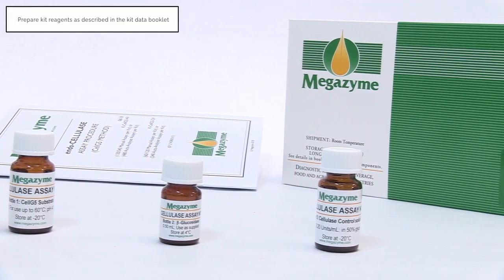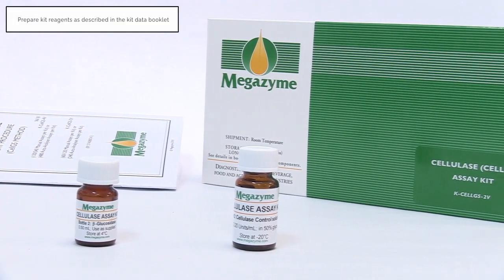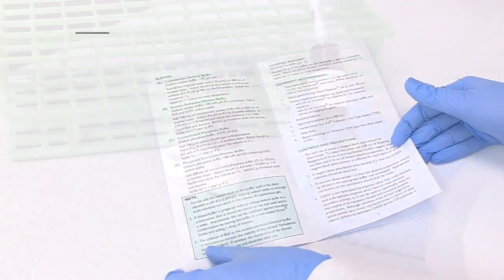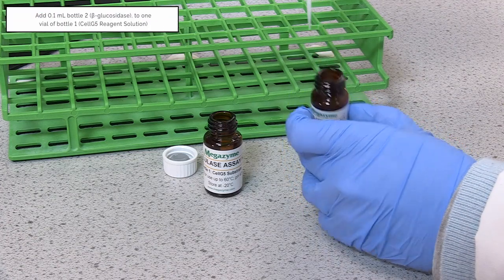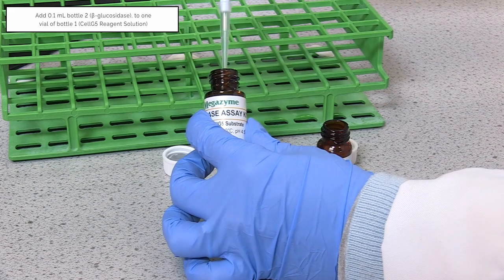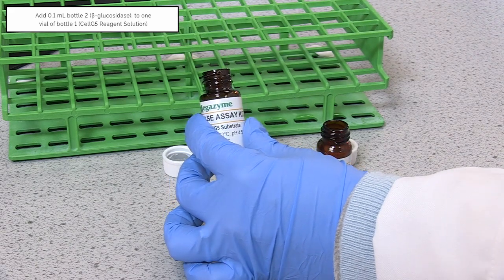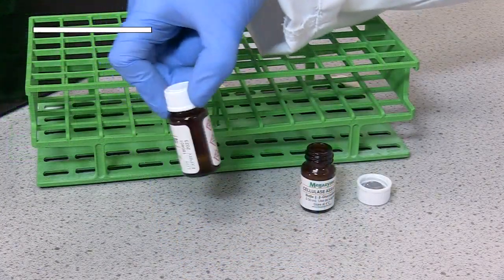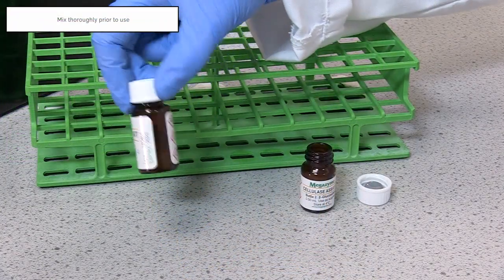Prior to sample analysis, the kit components should be prepared as described in the kit data booklet. The Cell G5 reagent is prepared by addition of 0.1 millilitres of Bottle 2 to 1 vial of Bottle 1. Bottle 1 should then be mixed well prior to use.